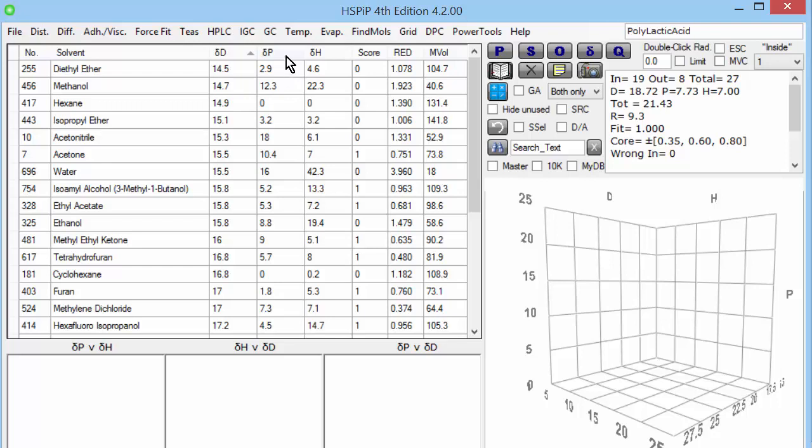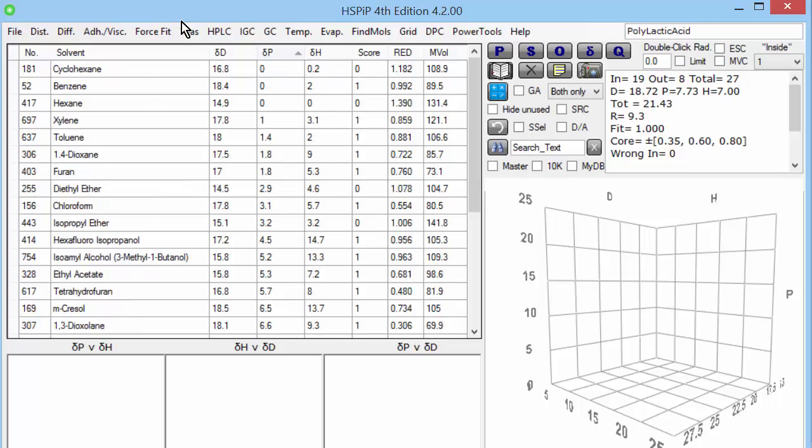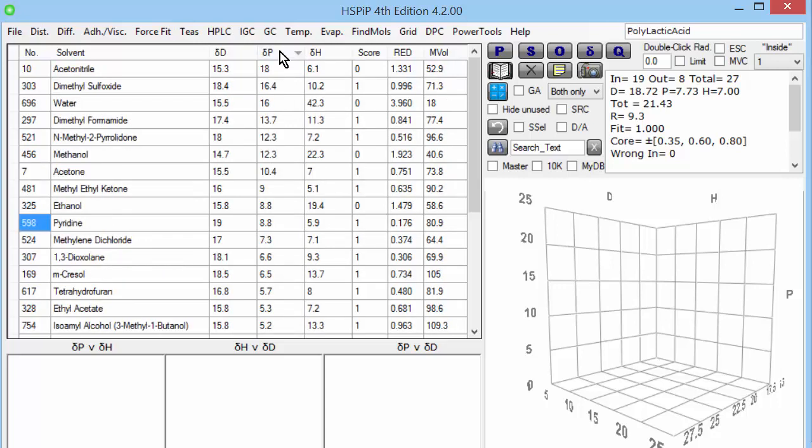The next parameter is DP. If I click and sort then we find that cyclohexane, benzene, hexane have no polarity. And at the other extreme we have acetonitrile, which is polarity on a stick, methyl, carbon, nitrogen, in a straight line. The large sulfoxide group on DMSO is also very polar. And something like ethanol is somewhere in the middle. Cresol, so forth. DP is very easy to understand. Our intuitions about it are largely correct.